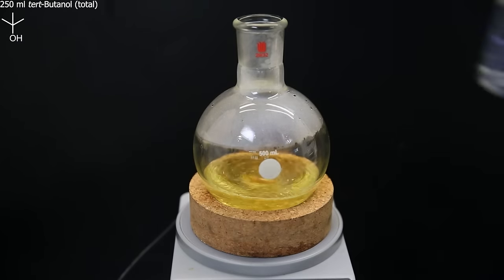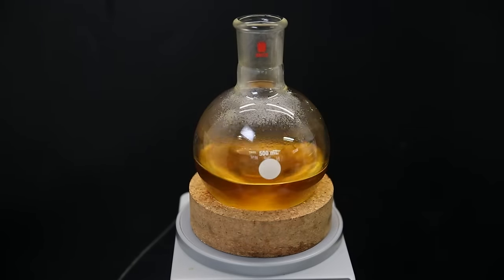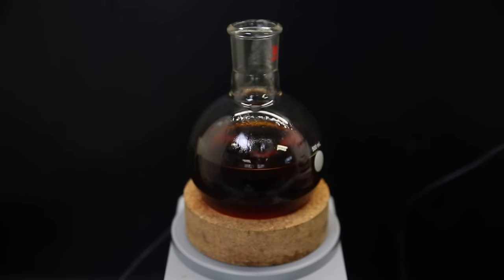Then, as a solvent, I add in a total of 250 ml of tert-butanol. But since this also has a melting point near room temperature, I had to wait for it all to liquefy. So I added it in portions, because I was being impatient. After adding the first bit of tert-butanol, it gradually becomes dark red, and I left it to stir for a day.